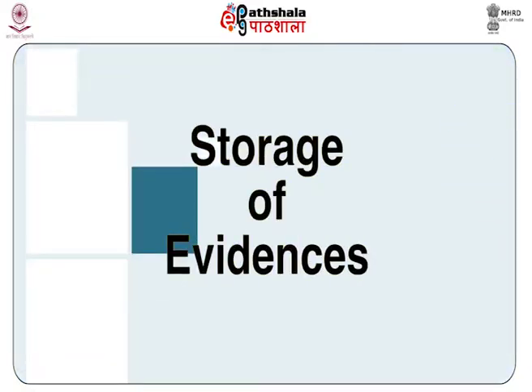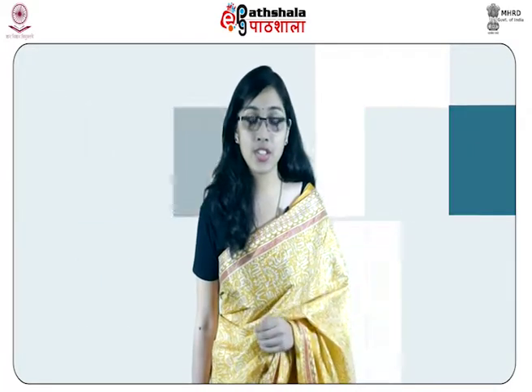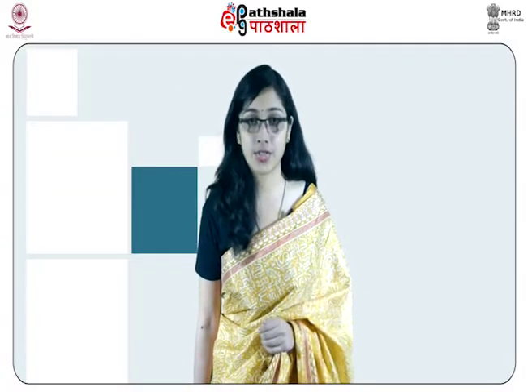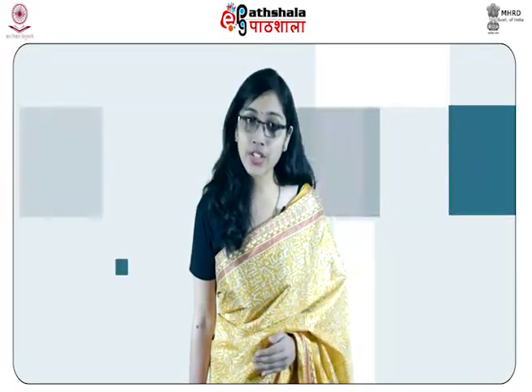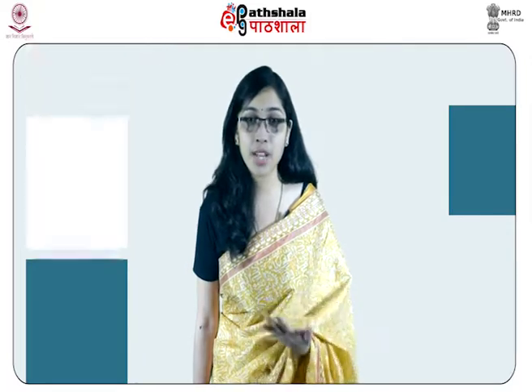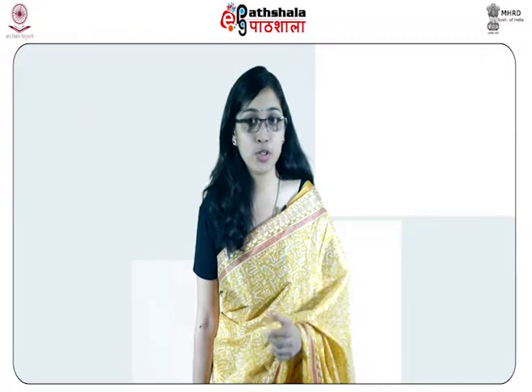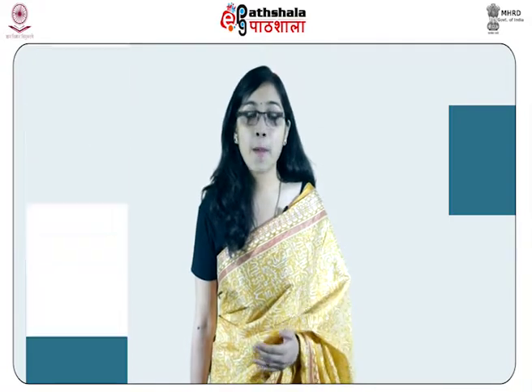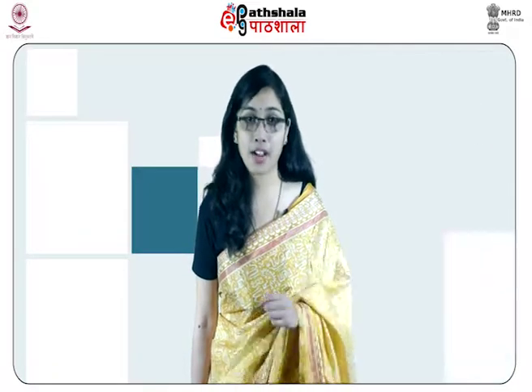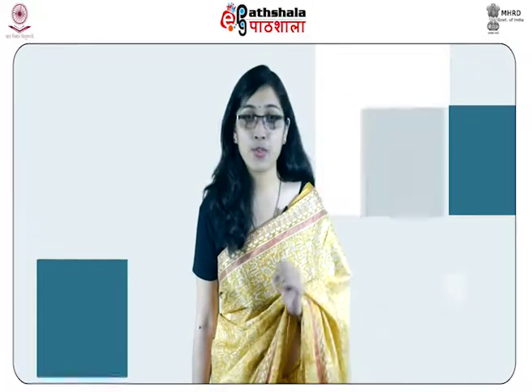Next, we will study the storage of evidences. Storing evidences during all phases of investigation and litigation is necessary. The evidence should be dried and stored. Storage should be in a facility that minimizes extreme heat and humidity, which may lead to DNA damage. Dried and odorous evidences should be kept in a sealed plastic bag. Those evidences which cannot be dried should be frozen.